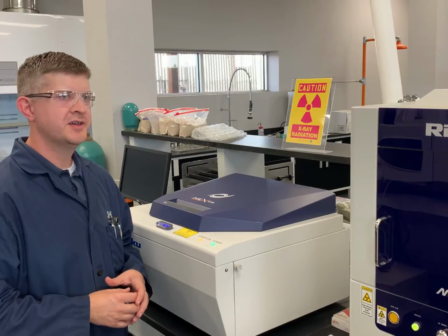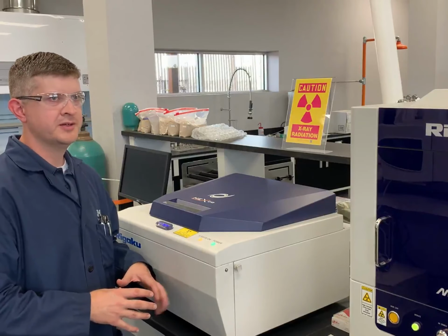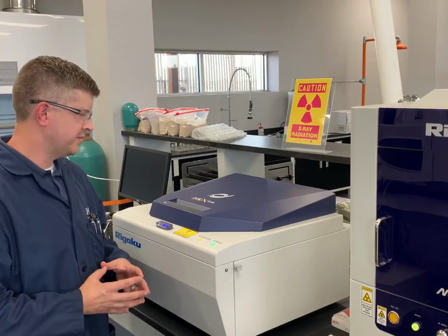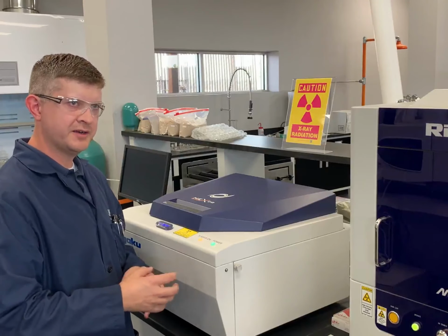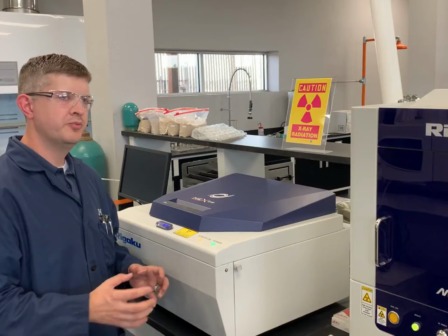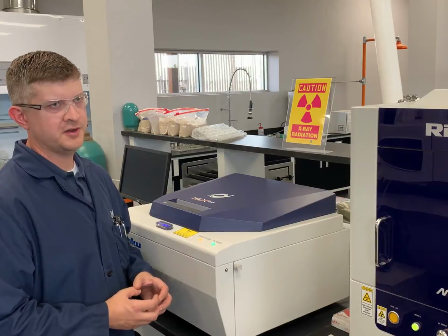Whenever that happens, it's going to fire off a particular energy from the atom, so it's going to be fluorescing as it interacts with the X-ray beam. So the detector is going to be able to see that that's barium that's interacting with the X-ray. It's going to be able to quantitate it and tell you how much per mass percent is barium inside that total solid.